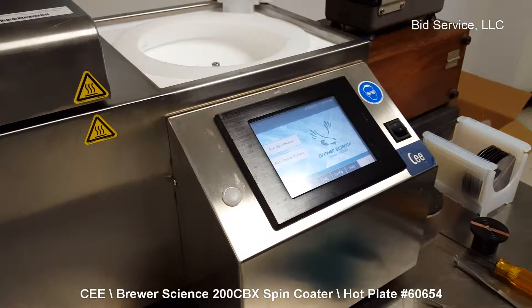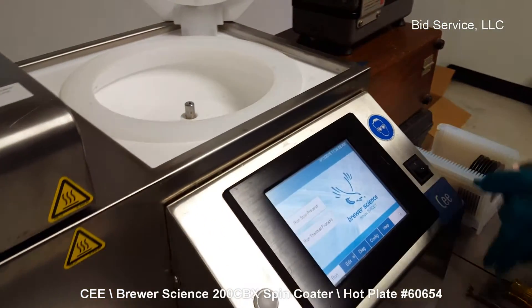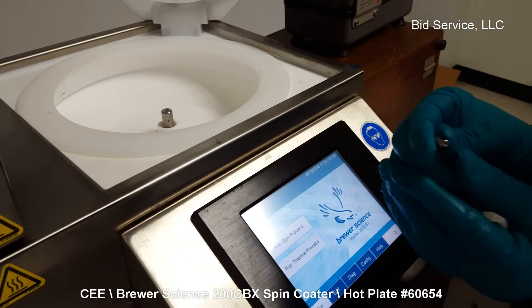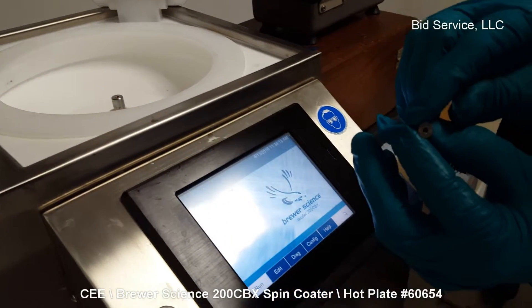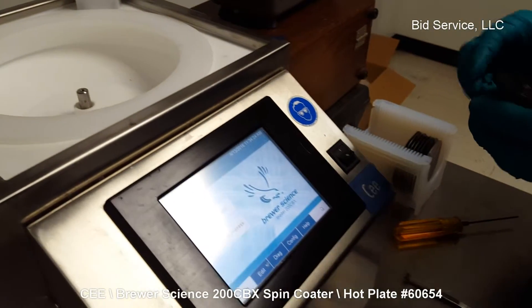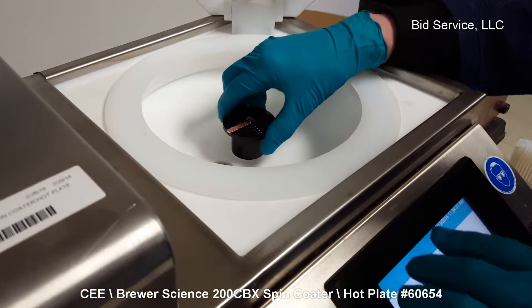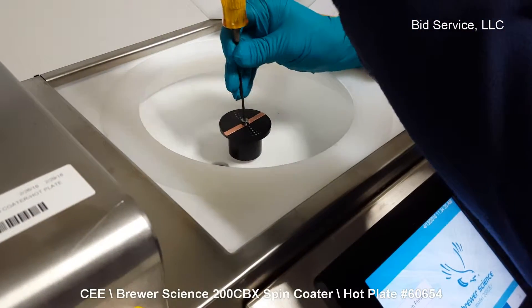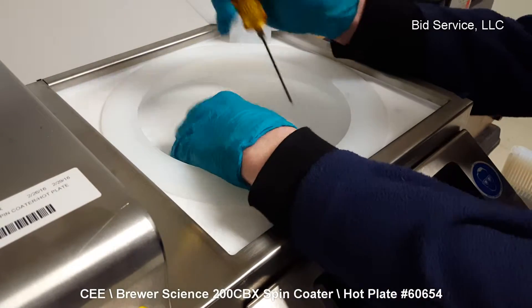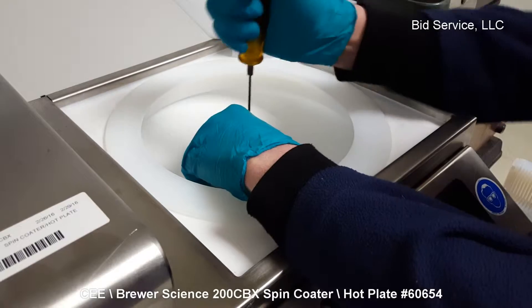To demonstrate the speed range of the spinner, I'm going to use the small chuck with a timing mark on it. It's important to note that the screw which holds the chuck in place is very important — there is a hole drilled right through the middle of it to allow vacuum access to the top of the chuck and the bottom of the wafer. There's a pin here that aligns the chuck. You shouldn't over-torque this, but you shouldn't have any wobble either, so it's important to just tighten it down good and snug.